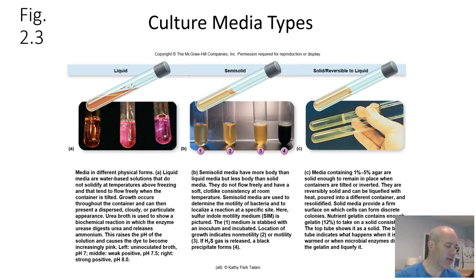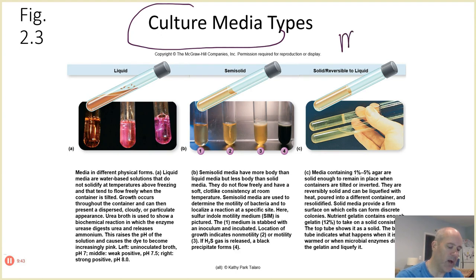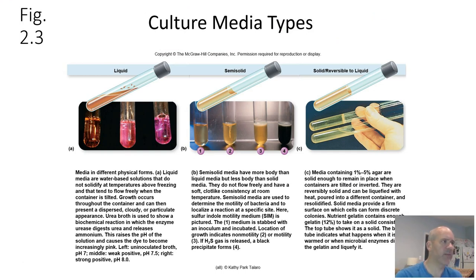Okay, so the substances in a laboratory that are used to grow microorganisms are called culture media. Medium is the singular form of the word. Media is plural. And we have three major types. We have liquids, which are also sometimes called broths. You can have broth media. And so these are liquids that contain nutrients in them. You put your microorganisms in there, and they multiply.